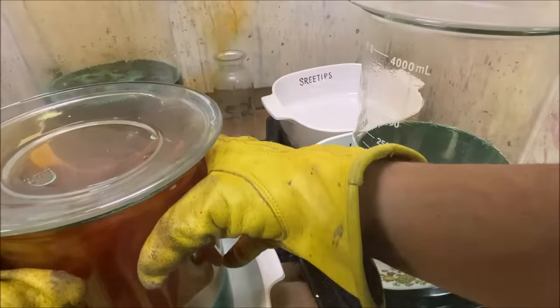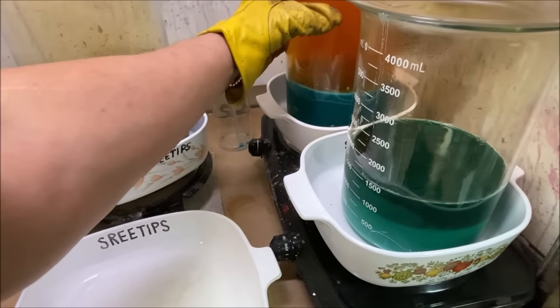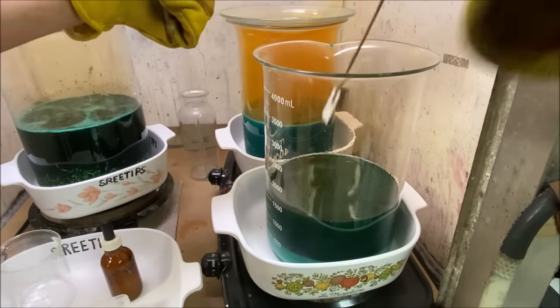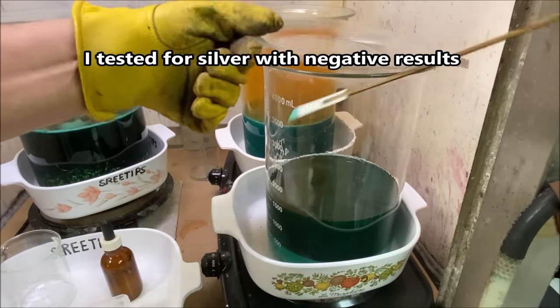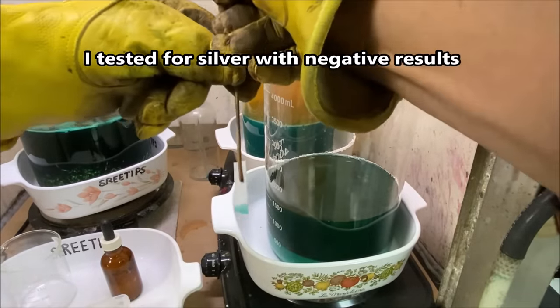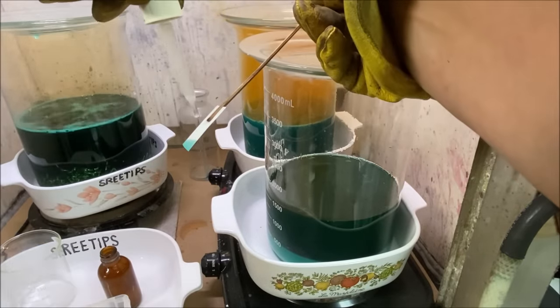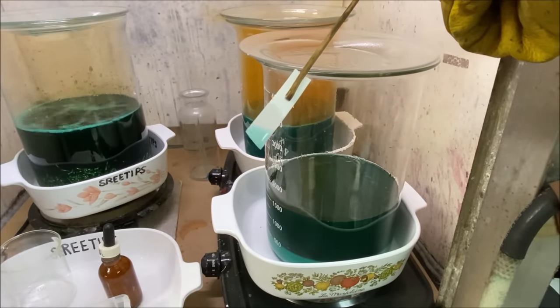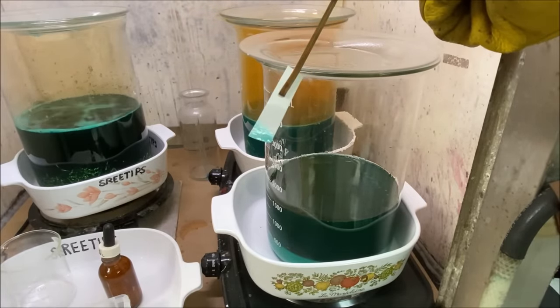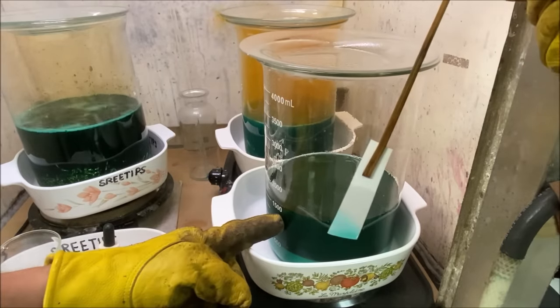Now the reaction's calmed down a little bit. Now we'll set this back up on some heat. Now we'll do a stannous test on this liquid, make sure we're not putting anything in solution, because I intend to discard this solution. And as you can see, no color change present, which tells me that all we have in solution here is copper.